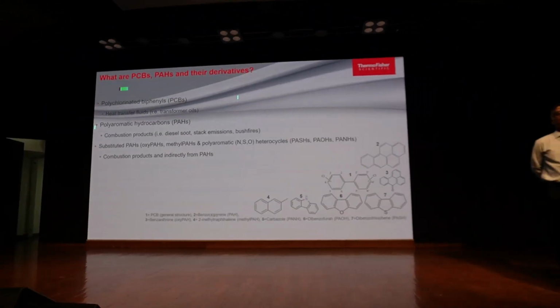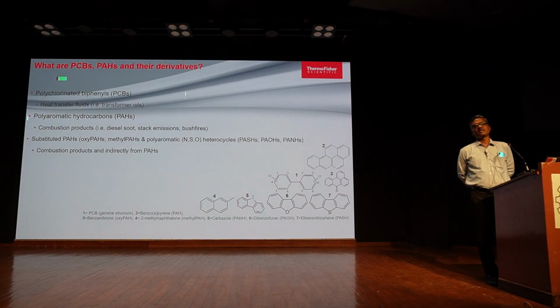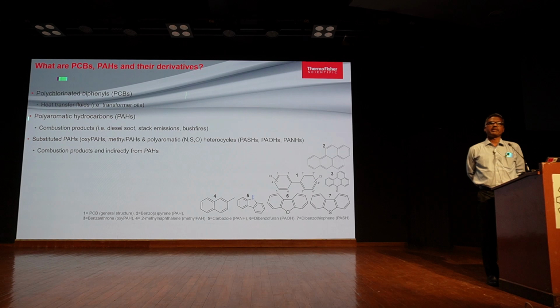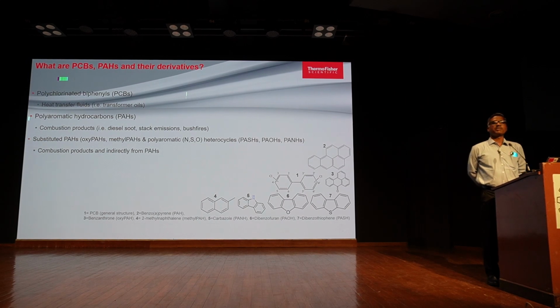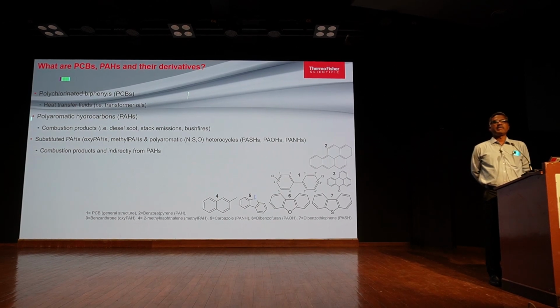But the identification and confirmation criteria will remain the same, as well as your quantitative criteria, irrespective of the permissible limits. Based upon your regulatory requirement, you need to set your limit of quantitation in terms of identification and confirmation, followed by the quantitative approach.